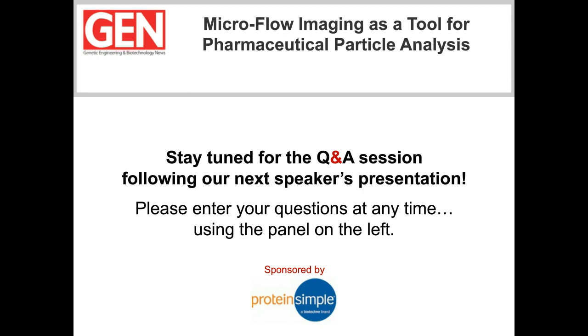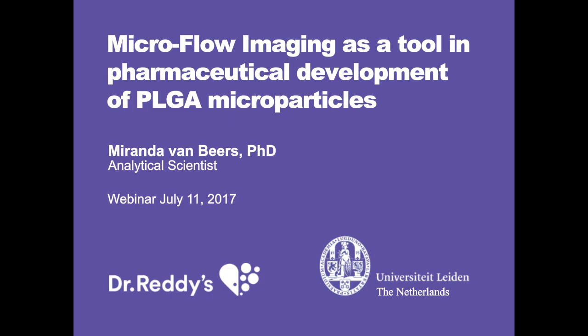Thank you, Colin Merrifield, for explaining the role that MFI can play in the analysis of therapeutic proteins. In my part of this webinar, I will be talking about how we at Dr. Reddy's are using MFI as a tool in the pharmaceutical development of PLGA microparticles.